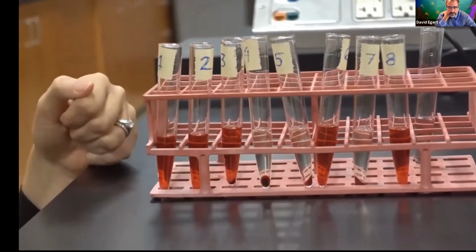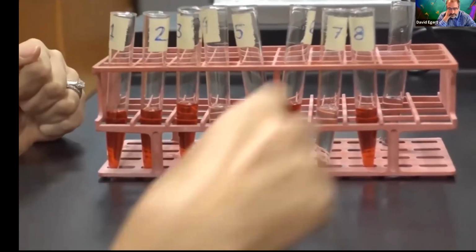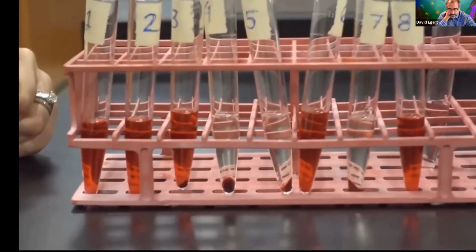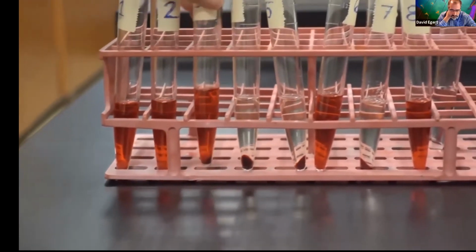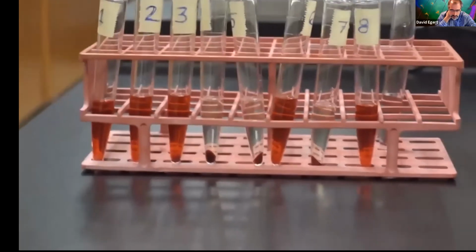The fluid on top of the pellet is known as supernatant. And so those have clear. You also see it in test tube 7. And then all the other ones have some shades of pink. And you can see a little bit of a pellet down at the bottom here too. So we'll wait until we have the next batch too, so we can do our full comparison.